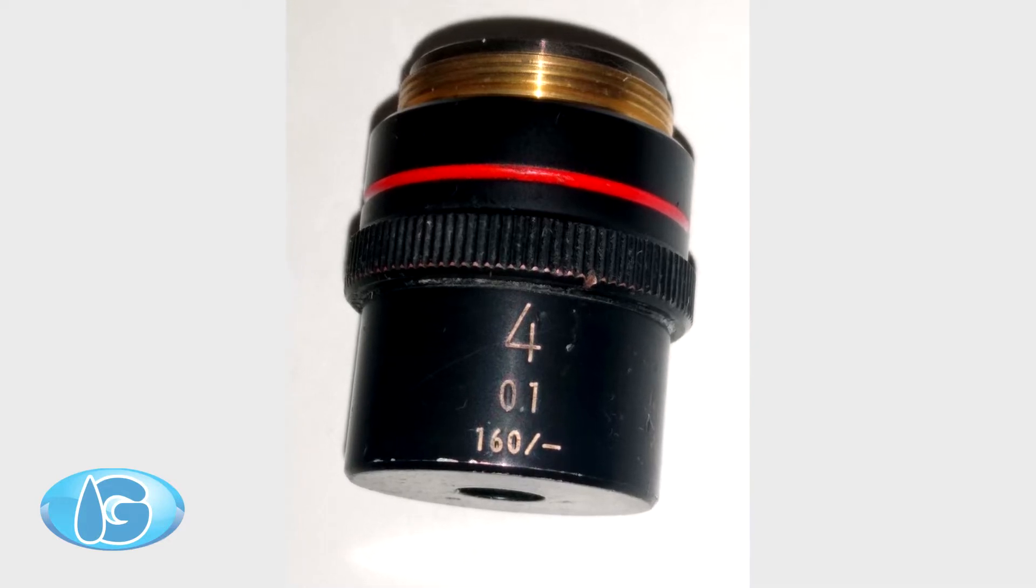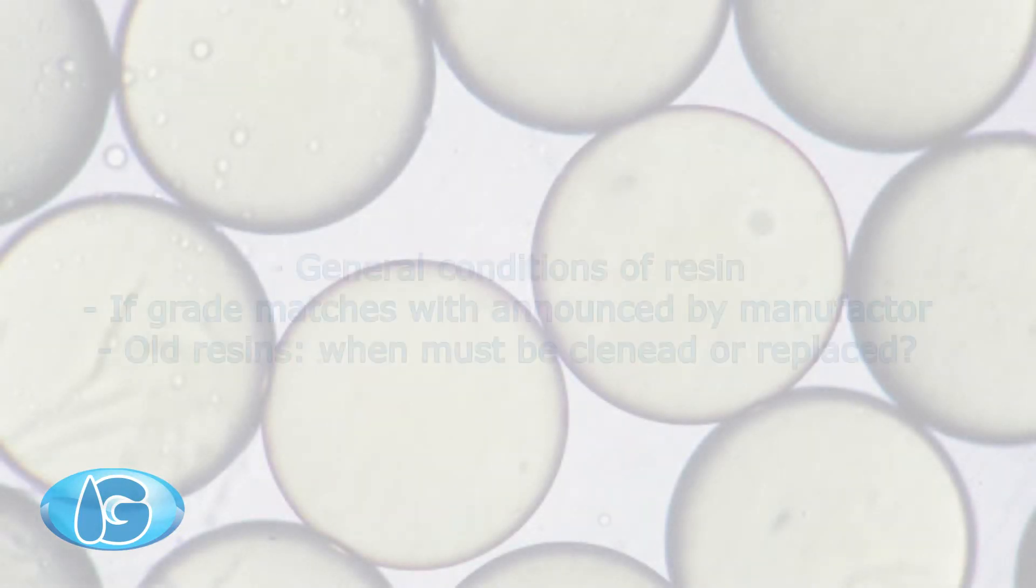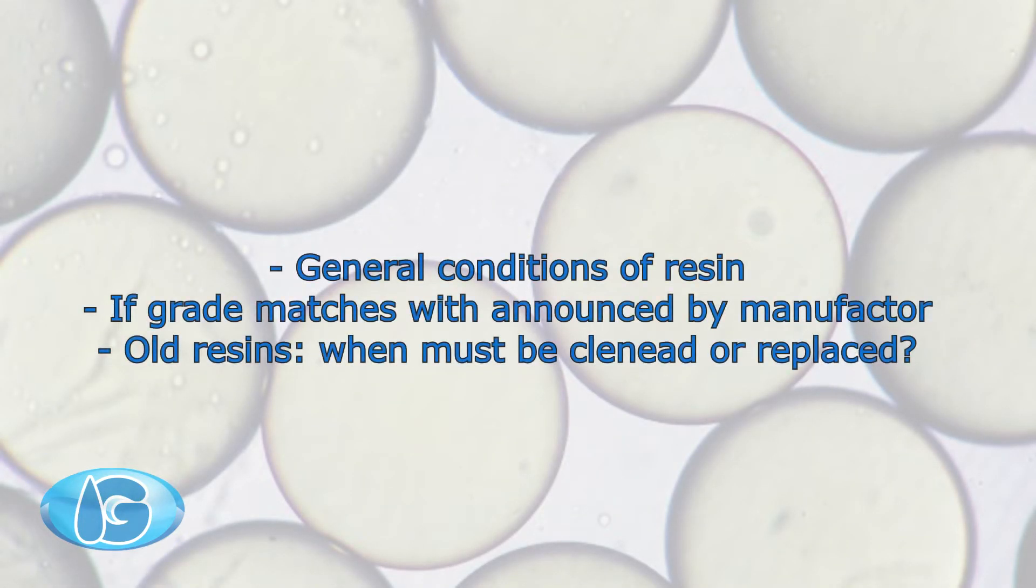So microscopy helps you evaluate conditions of resin, see if the grade promised by manufacturer matches, or if the resin is or not at the point to be replaced by another one.